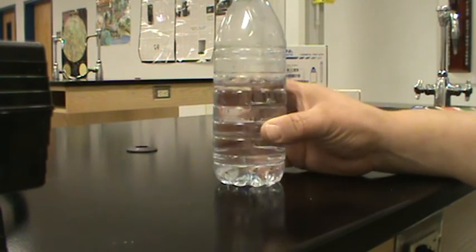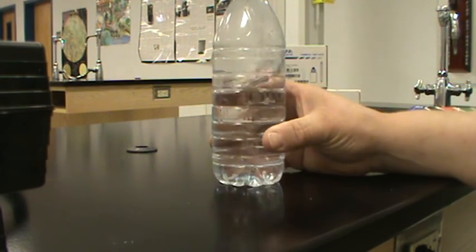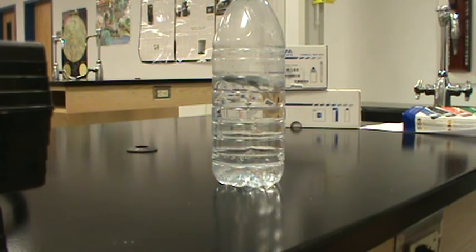But anyway, this student would like to know the quality of this water coming out of the well. Most of our wells around here are between 100 and probably 250 feet deep to get into that artesian layer. Some wells are deeper, some are a little bit less. And so we're going to use this water, and we're going to do this. And this is the setup. And when we come back in the next segment, we will start with the phosphates and the nitrates.